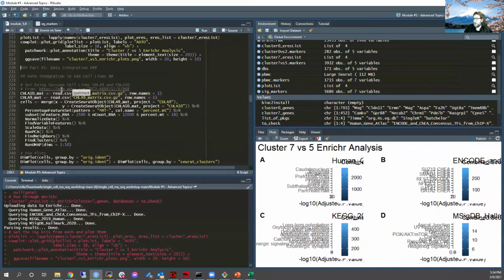All right, so now that we have recapped everything and I did what I promised I would do last time, which is go over the activity, I'm ready to get started with data integration here. So before I jump in, do you guys have any questions or anything that was unclear from what I just covered, which I know was super fast?